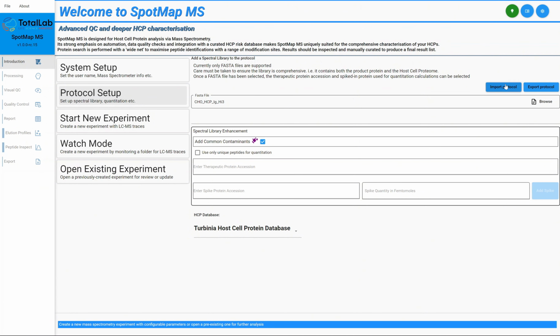You can have saved protocols, so you can have templates. So you can import and export your protocol. So if you want to do any kind of tech transfer, if you're a service provider and a user has provided you with their protocol, you can be guaranteed that you're running the exact same settings, you're doing the analysis in the exact same way. So this is one of the features we've introduced to reduce subjectivity using this technique, allow tech transfer, allow harmonization between maybe different sites located worldwide to make sure your pharma company X is doing everything the same way in all of its different locations. So there's a certain measure of standardization there.